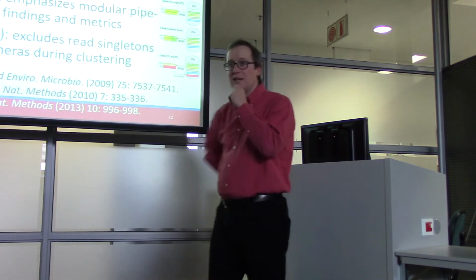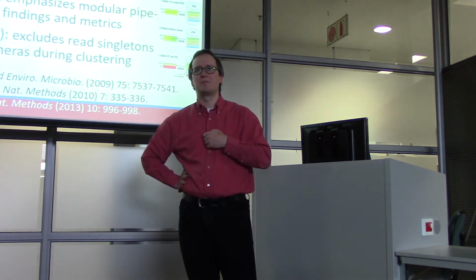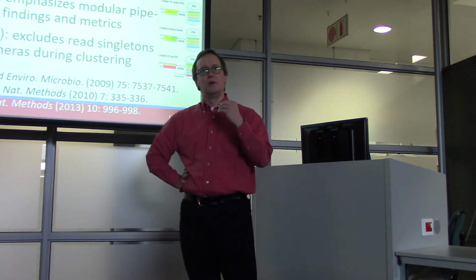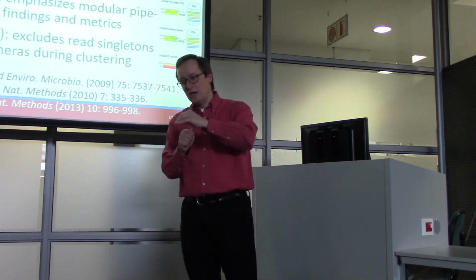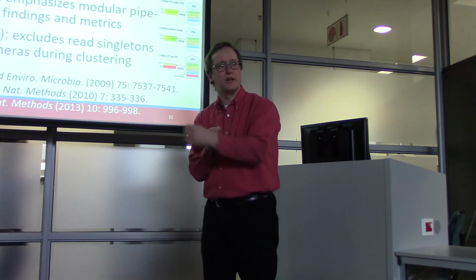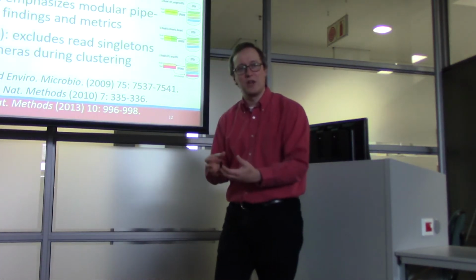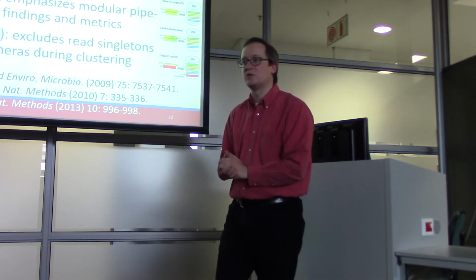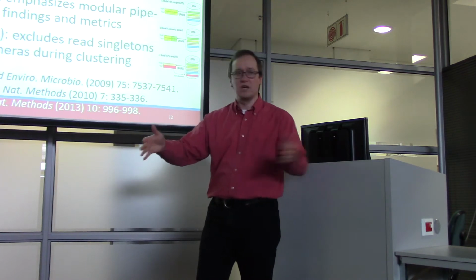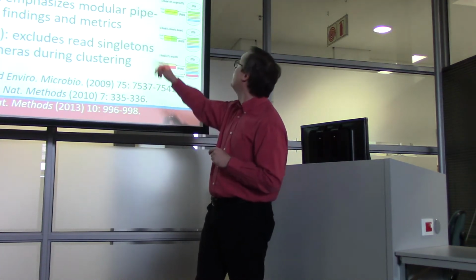So QIIME is a little different. QIIME reminds me, in some respects, of the OpenMS project in proteomics, in that they've really tried to create a plug-and-play system where if you want to try a different system for clustering or try a different similarity assessment system, you can change those components to do so. So it's a modular pipeline of these tools designed to work in one seamless workflow, and they've done a fair bit of work on visualization and metrics.